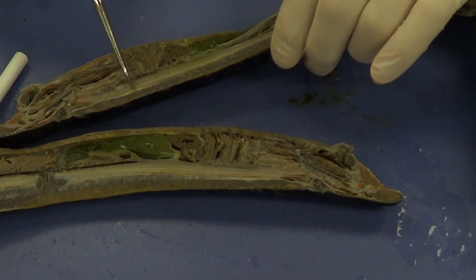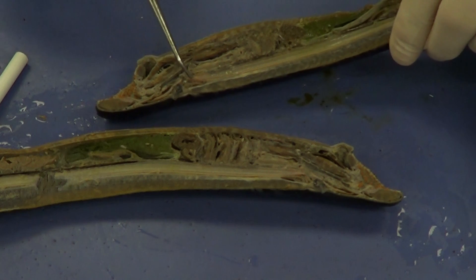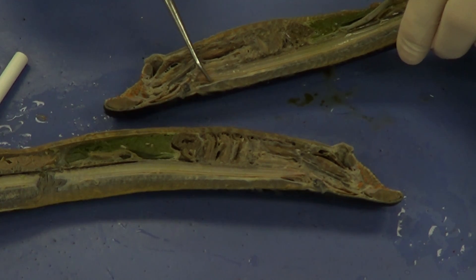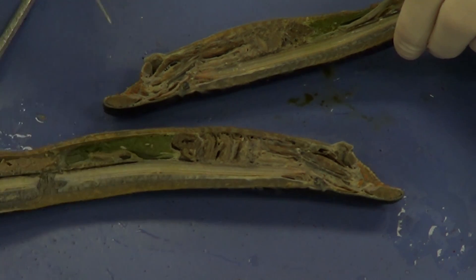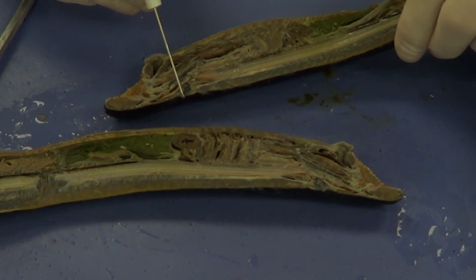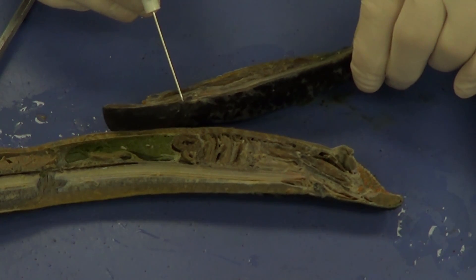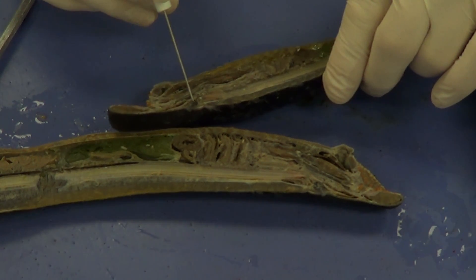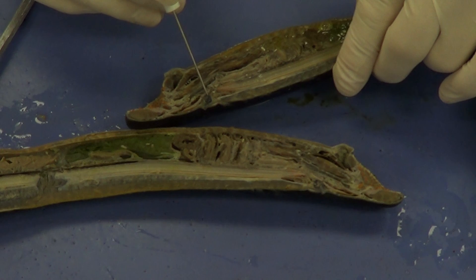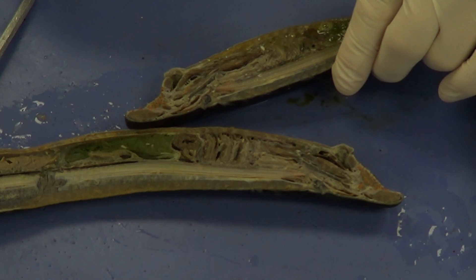If I follow the spinal cord anteriorly, I come to the brain right here. Now, anterior to the brain, I can see that external nostril that I was talking about earlier — and that external nostril actually leads to an olfactory bulb or olfactory sac. It's sort of black in color — you can see it right there.